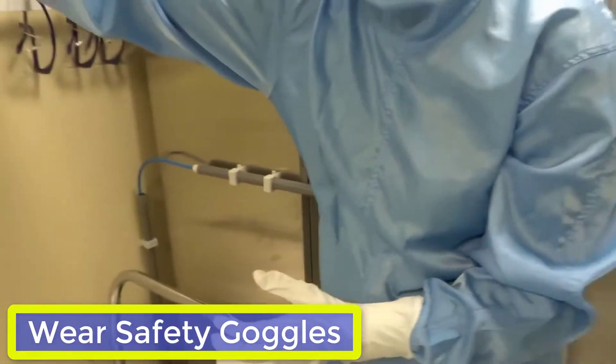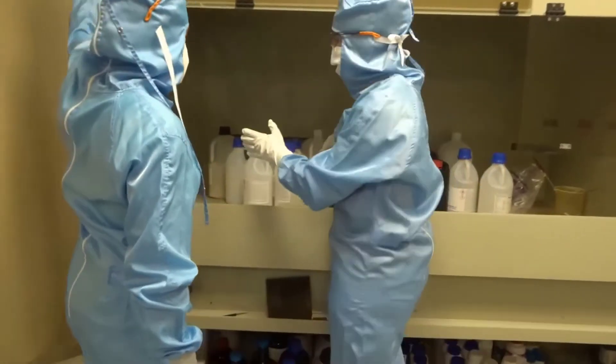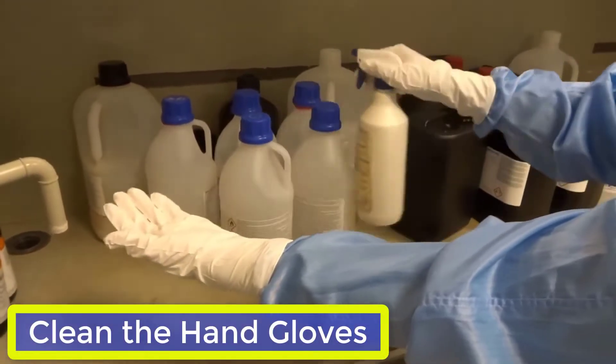Do not forget your safety goggles, which are compulsory in the cleanroom. You can now clean your gloves with cleanroom soap and rinse them thoroughly with DI water.